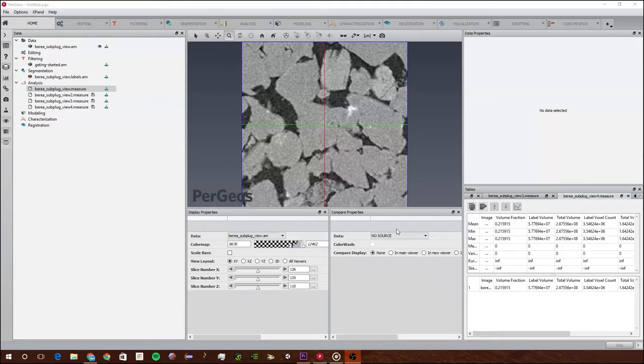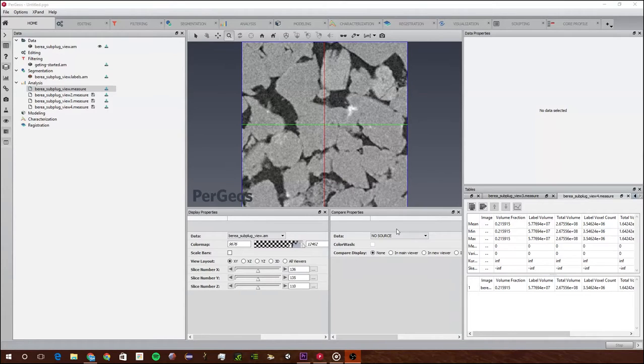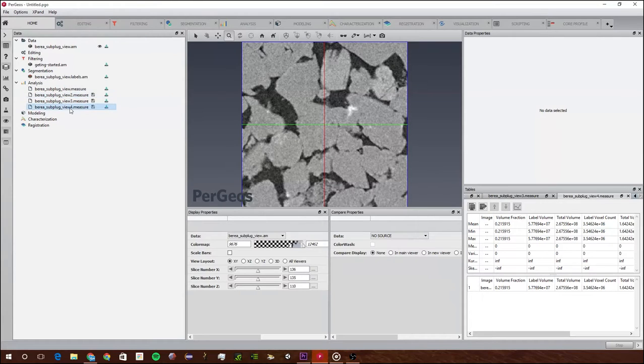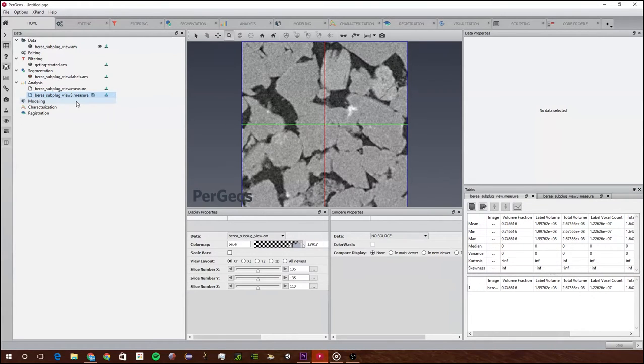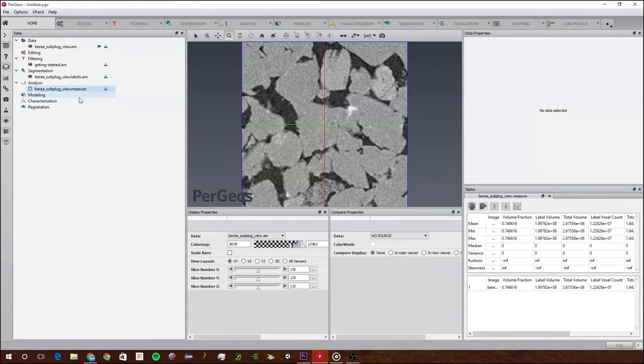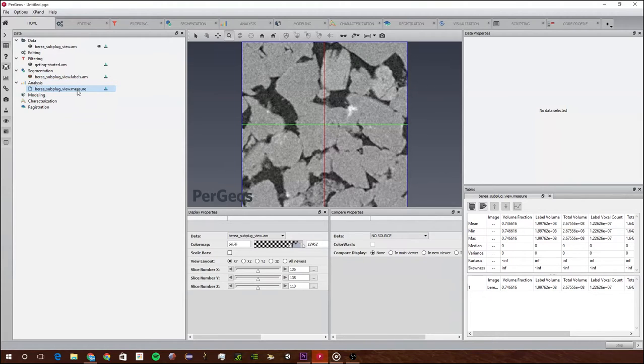To start to create a recipe, if you click right in the center of the screen it will take you back to the last tutorial. I expect you to have done that tutorial, and now I'm here right after that tutorial. I've done that once but let's say I want to do it to something else.